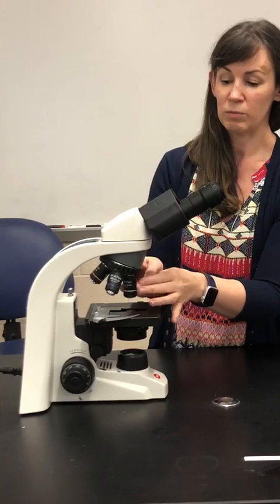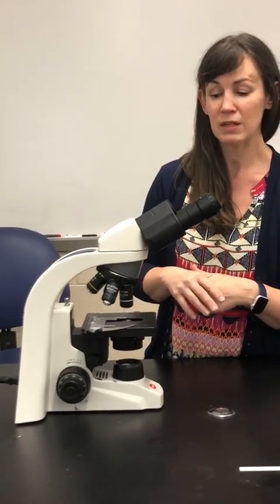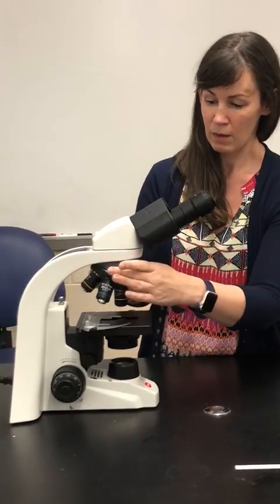This objective, paired with these lenses in the ocular, are able to blow up what we have on our slides 1,000 times bigger than it actually is, which is what we need to be able to see bacteria. And you'll see that even with that much magnification, the bacteria are still very, very small. So we're looking at tiny, tiny organisms.